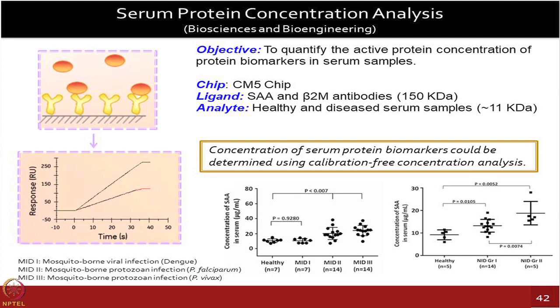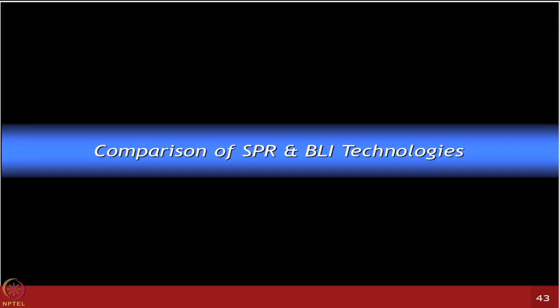This is what you need. You cannot do validation on a large number of samples using mass spec or other technologies. So you have to come down to either ELISA or these kinds of label-free approaches, which can screen the same molecules in a very high throughput manner. So this was a good experiment for us to show that we can actually measure the concentration of this protein of interest. Sometimes you have to develop these assays in the beginning, so you need pure protein. It's a good idea to try out something like this with known proteins for which you have purified proteins available. Build the confidence and the assay conditions from those, then you can apply them to unknown compounds as well.